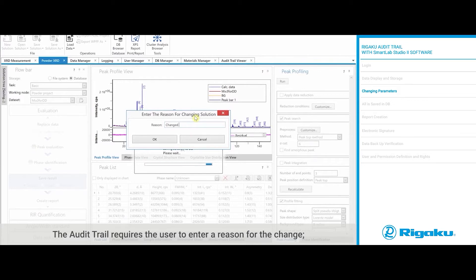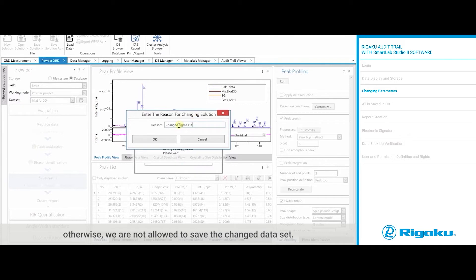The audit trail requires the user to enter a reason for the change. Otherwise, we are not allowed to save the changed data set.